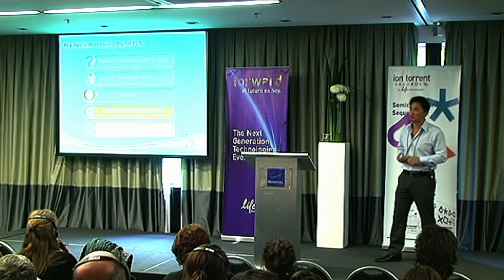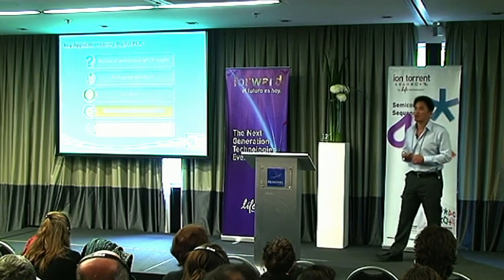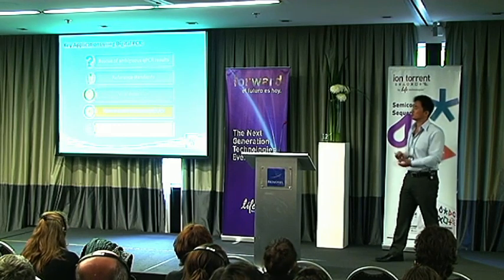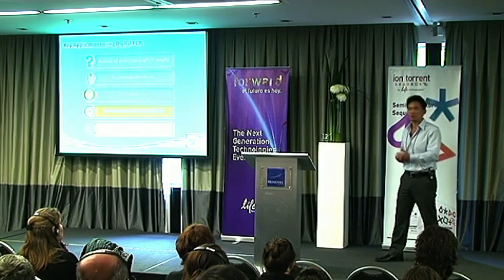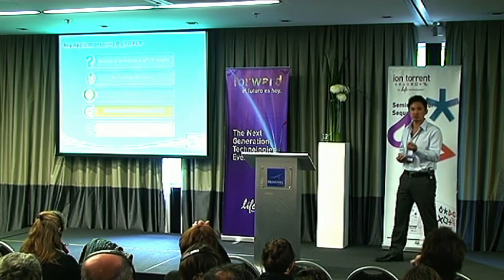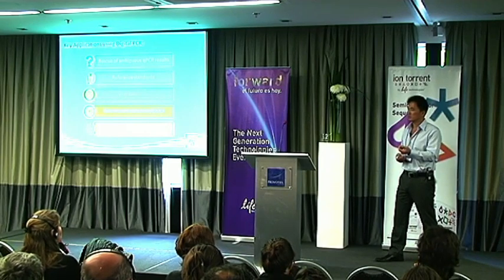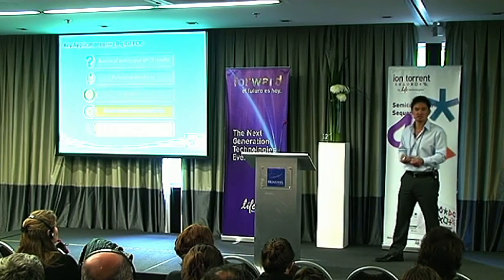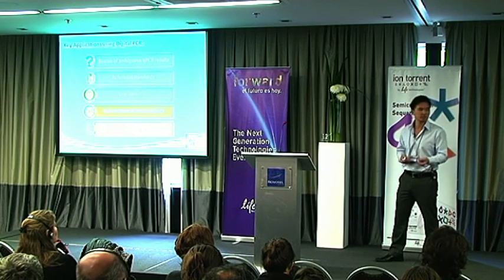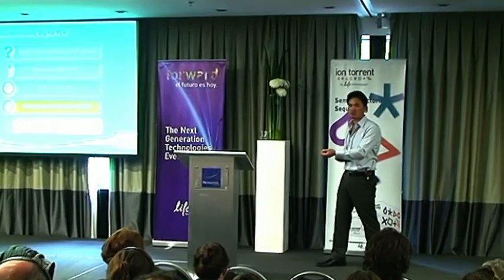The uses of digital PCR, obviously, are viral quantitation, trying to ascertain true copy number. So if you're looking at copies of a gene and comparing patient A to patient B, and let's say the resolution of qPCR stops at, let's say, 2-fold discrimination. Let's say you have 4 copies of an HIV susceptibility gene in one patient, and then you have 5 copies in another patient.